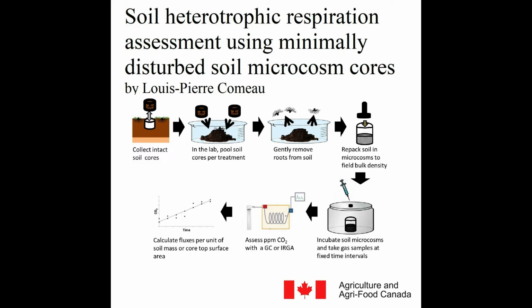Today I will summarize the minimally disturbed microcosm core method to assess soil respiration in a lab. This method consists of 7 main steps.